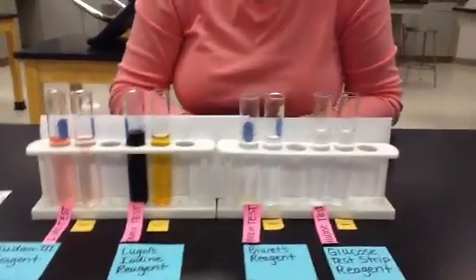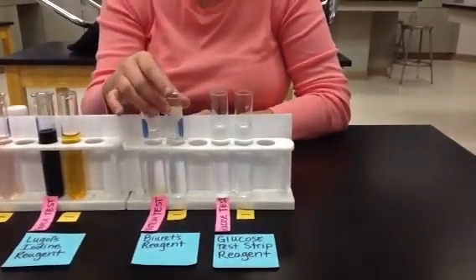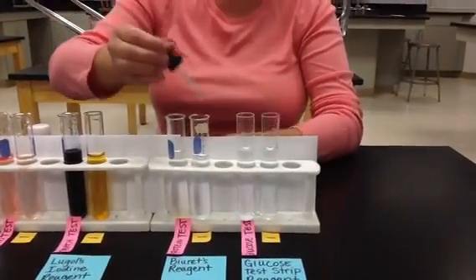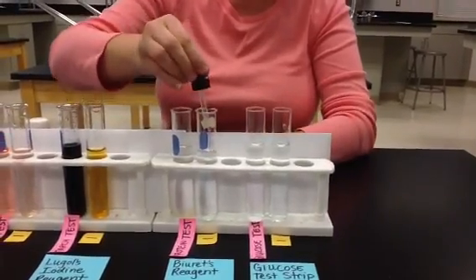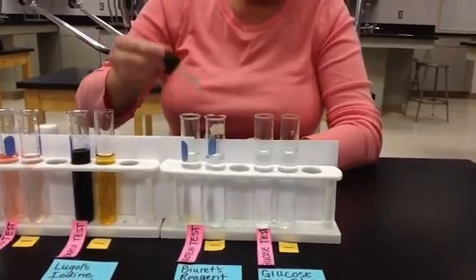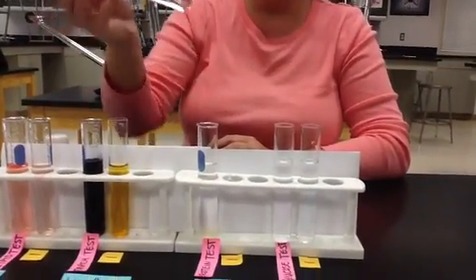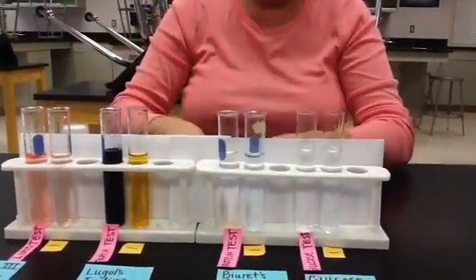The next one we're going to use is Biuret's. Biuret's is a reagent that we're going to use for the test for the presence of protein. So we'll start with our negative test first. And we have to add quite a bit of this to really see the reaction, so you might see me add quite a few drops, and you may have to do the same thing for your own test. Hopefully we got enough. Okay, so that's our negative test. Basically it should stay either pretty clear or maybe a light blue. And that's pretty much what we see.